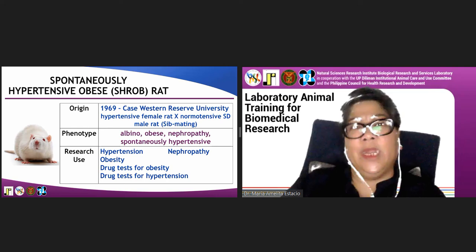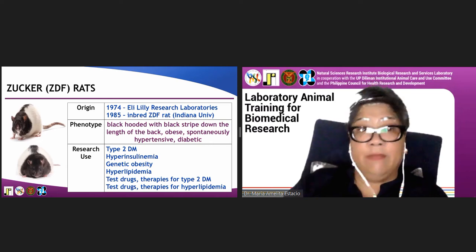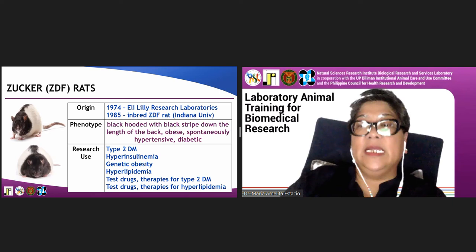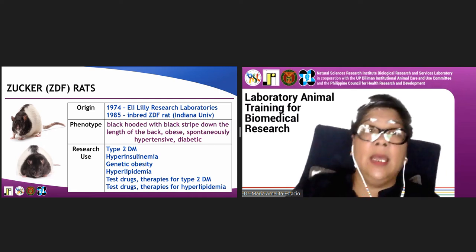Next would be the Zucker rats. This was developed by Eli Lilly, or Elanco, as it is named now, a big pharma company, in 1974, but it was Indiana University that developed the inbred strain of the Zucker rats. So they're cute, right? They have a black hood, and this is a hypertensive, obese, diabetic rat. You can use this for research on these particular diseases, especially for testing drugs and therapies for type 2 diabetes mellitus and hyperlipidemia, as well as hypertension.